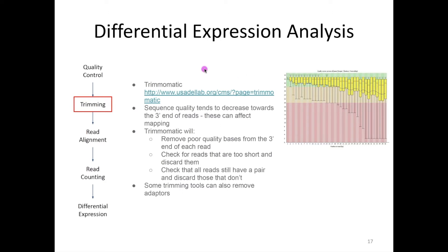This is a more typical quality plot. On the x-axis is the position in the read, from 5' end on the left to 3' end on the right. At each position, we're looking at the distribution of quality scores for all reads. As we go from left to right, the average quality decreases — that's typical of Illumina sequencing. But poor quality at the 3' end can make it difficult to map reads, so the first thing we normally do is run a trimming tool, which removes poor quality bases from the 3' end and discards reads that are too short to map after trimming.